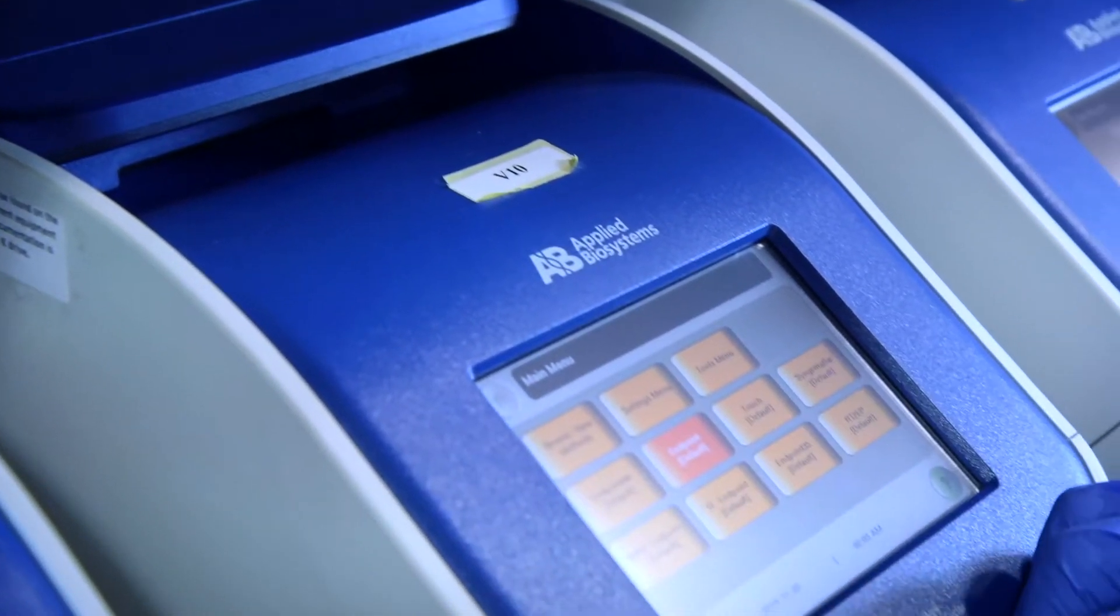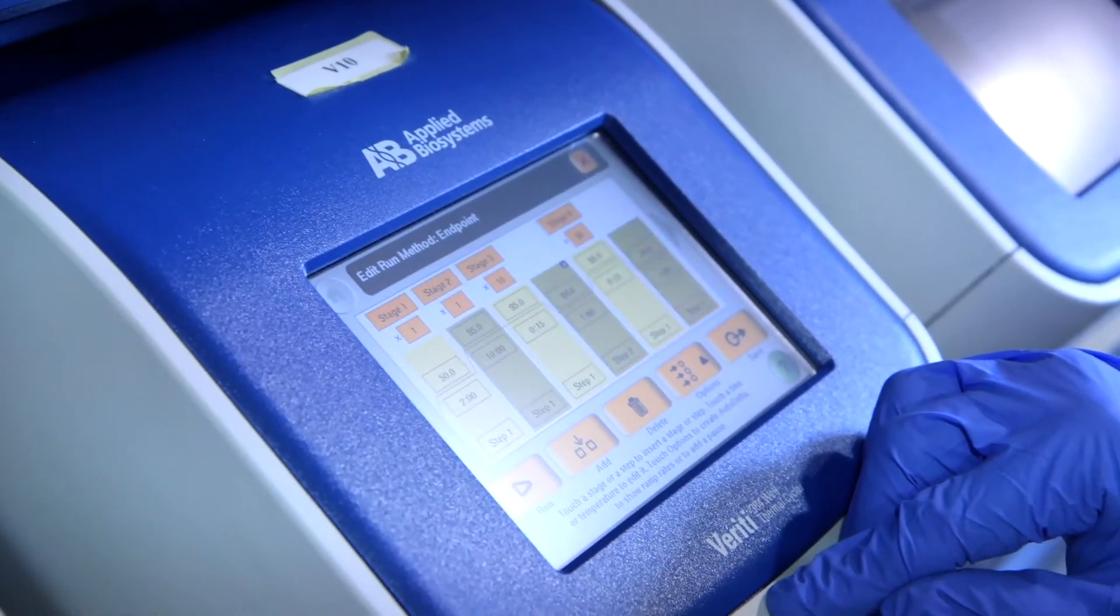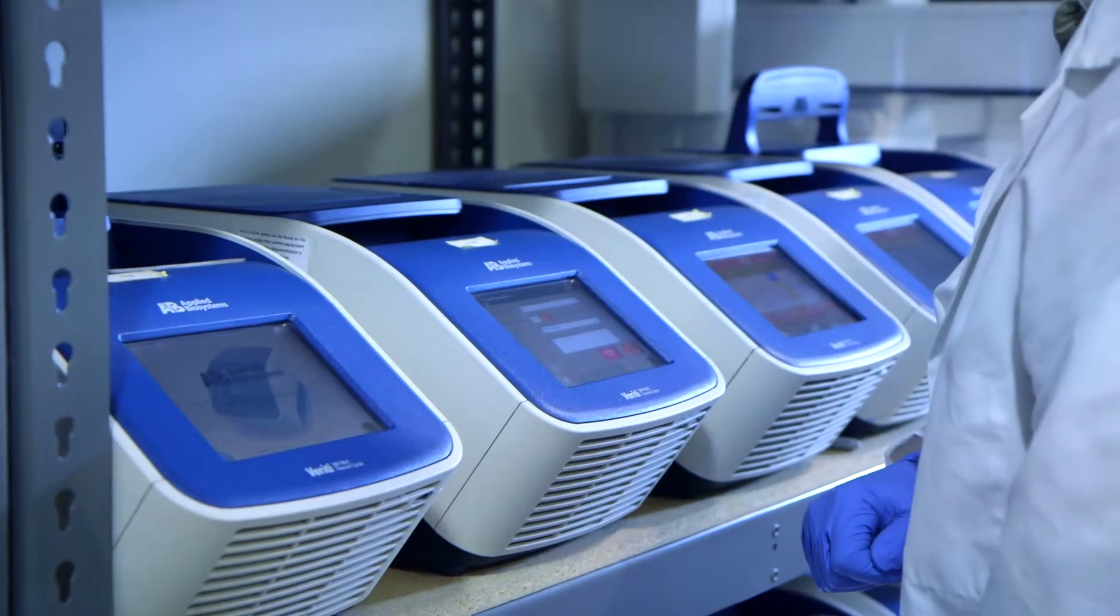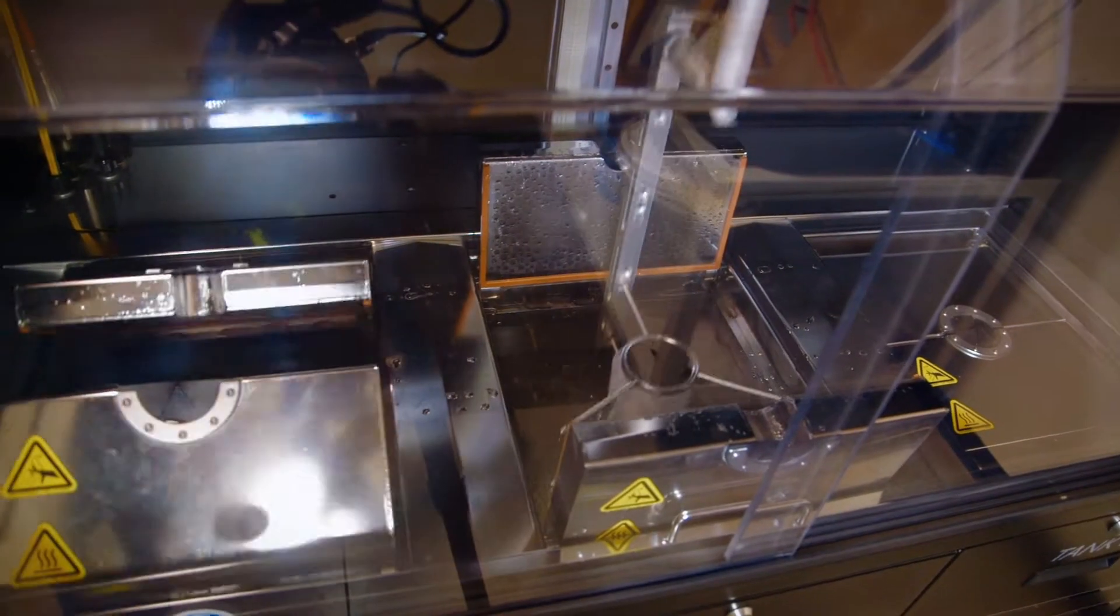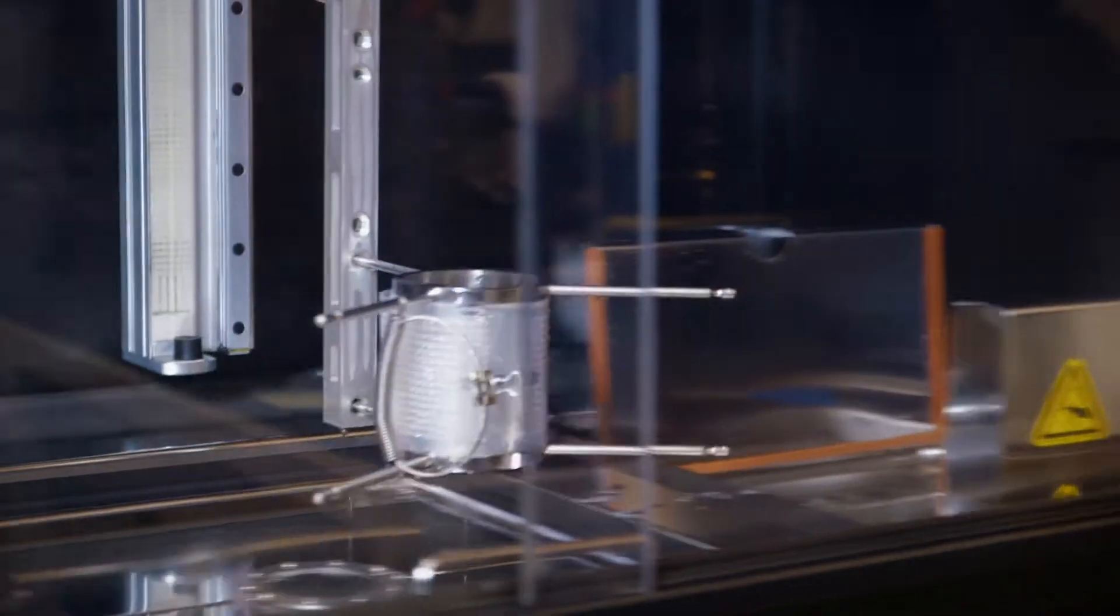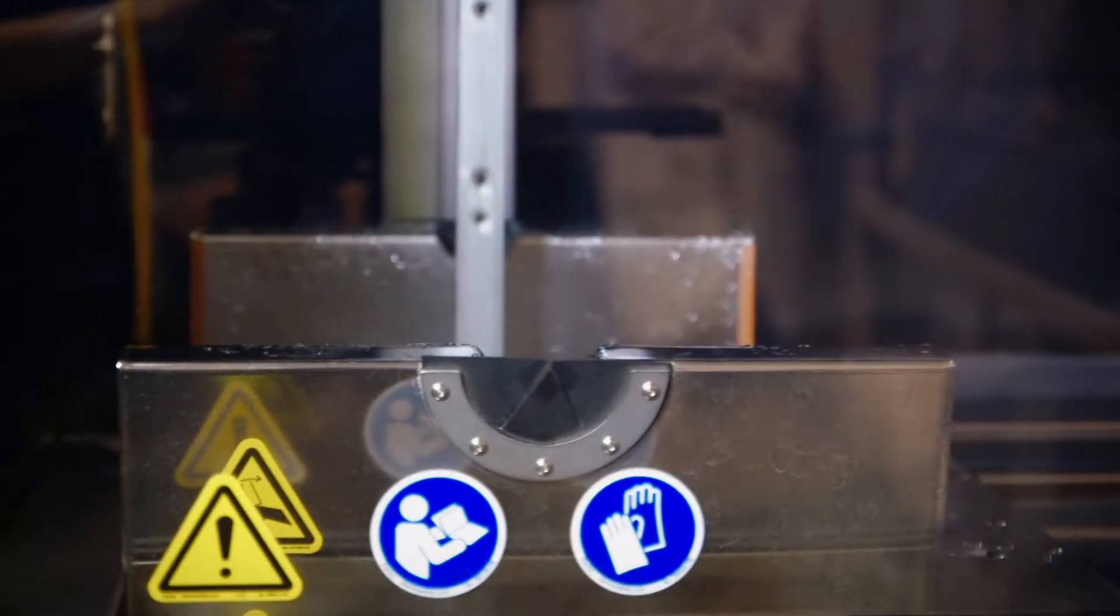The selection of markers will be based on the pattern of linkage disequilibrium and information of population structure specific to each breeding program. We convert the markers from chip to tape and run them on our high sample throughput platform. This reduces the cost and time of genotyping without losing accuracy.